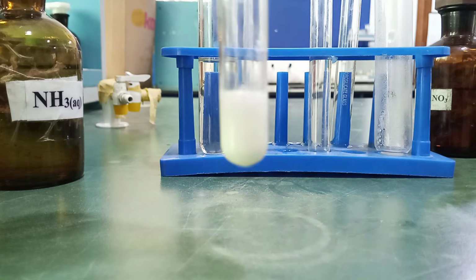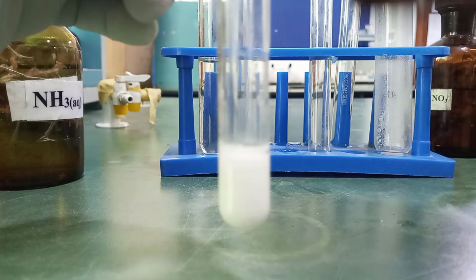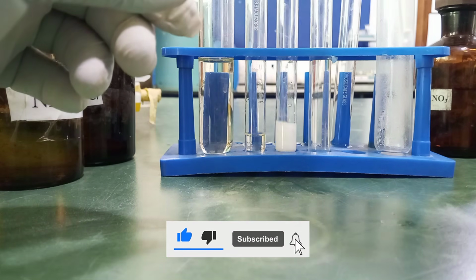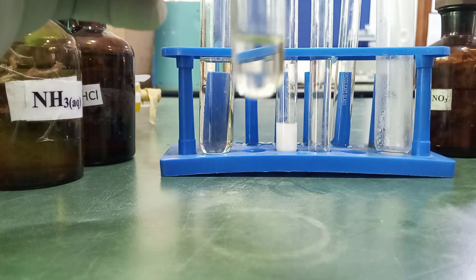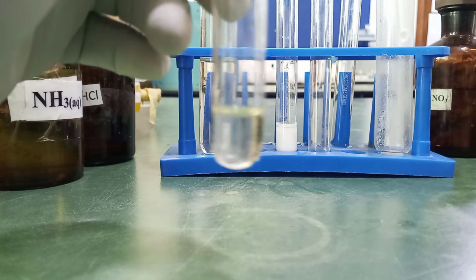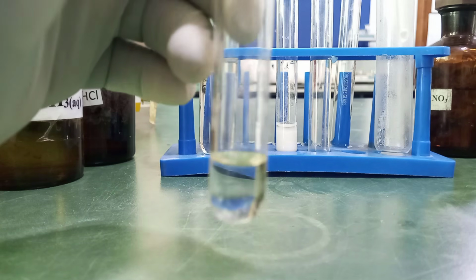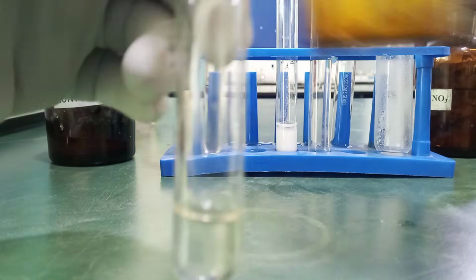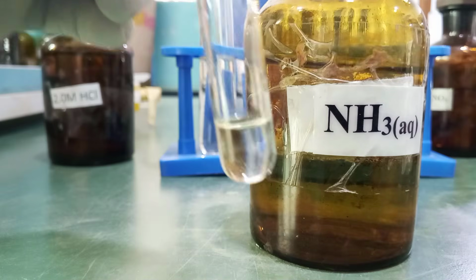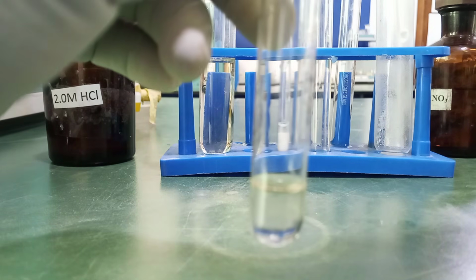Wow, you can see the white precipitate there. All right, so we'll expect this white precipitate to dissolve when in hot water. So we are trying to heat our water. We'll come back and put that there. So meanwhile, let's test with aqueous ammonia. Aqueous ammonia will give us a white precipitate in drops that will be insoluble in what?